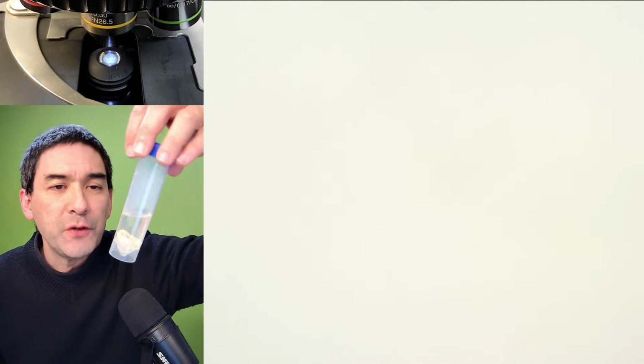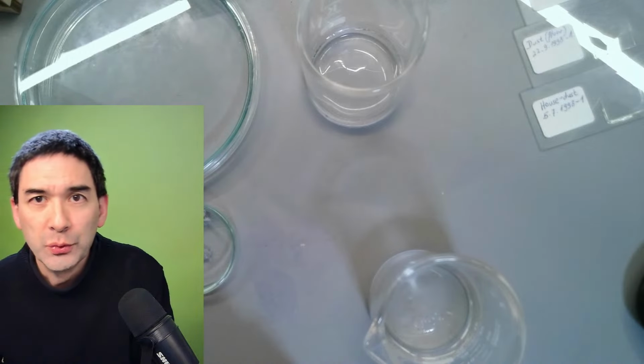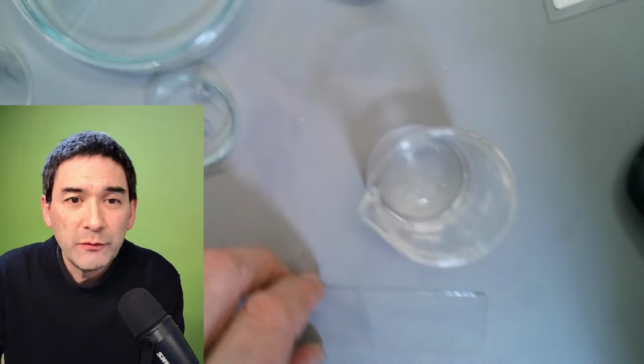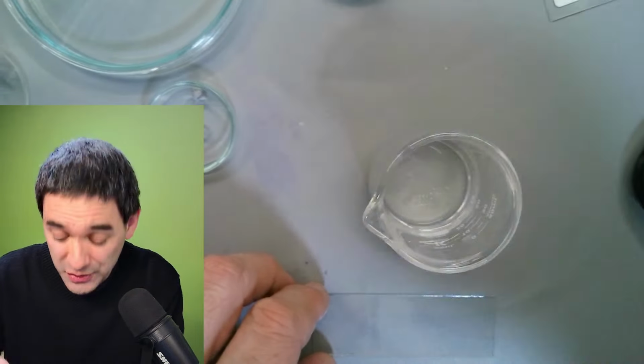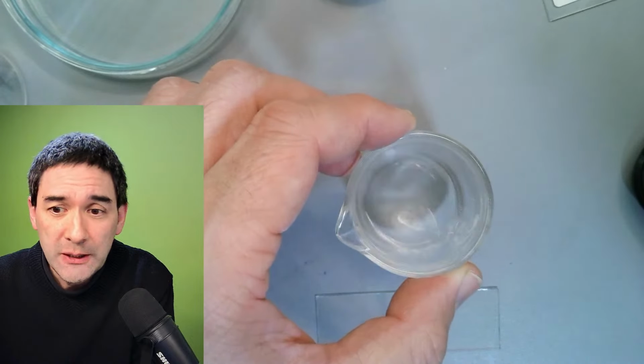This is artificial meat, so vegan meat, and unfortunately I was able to find a couple of fibers in there. I say unfortunately because I think they should not be in there, but this has also been found by other researchers: unfortunately, a lot of highly processed foods, also vegan meat and so on, contain a lot of these fibers, microplastics as well. So this one over here is now some water from my washing machine.